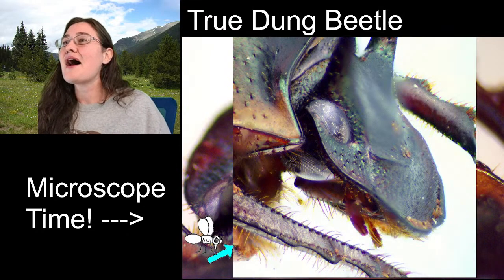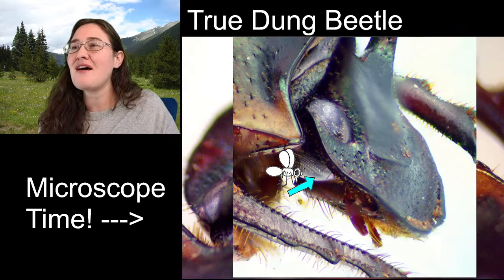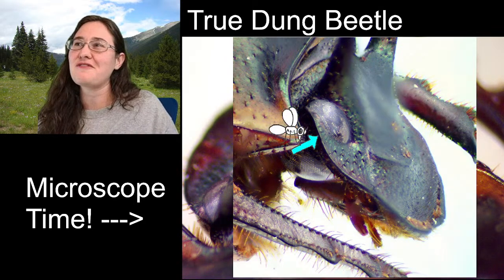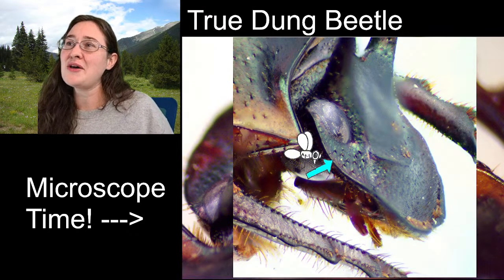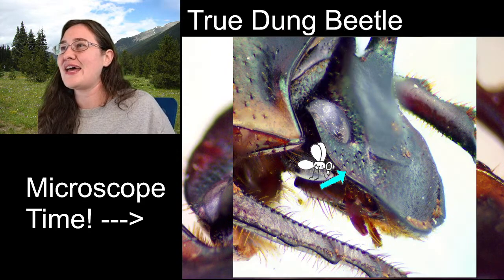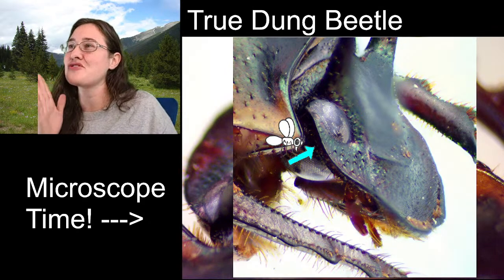All right. So this right here is the compound eye. And you can see all of the ommatidia, or all of the little individual lenses above and below what looks like this kind of weird face shelf. That's what we call it. We call it a shelf. And it's an expansion of the head, and it goes kind of over the eye, but the eye isn't cut off by it. The eye does exist underneath that shelf.